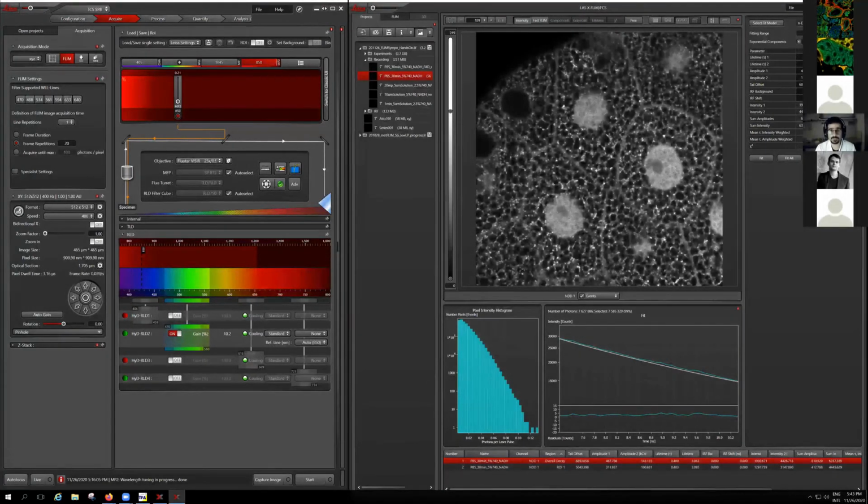Yes, in principle, you need to have good statistics, enough data points in your measured data, to calculate the decay using a fitting algorithm. But in our case, the decay curve that we are seeing here is a decay curve from the whole field of view.